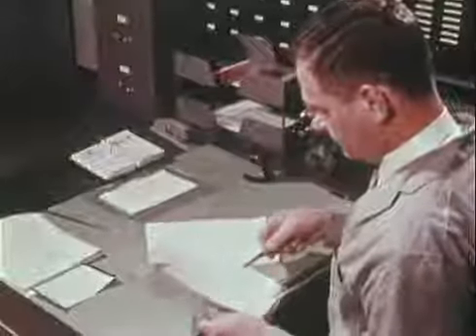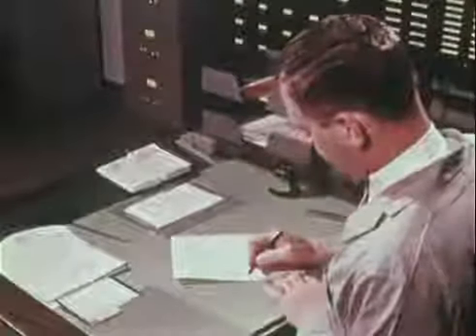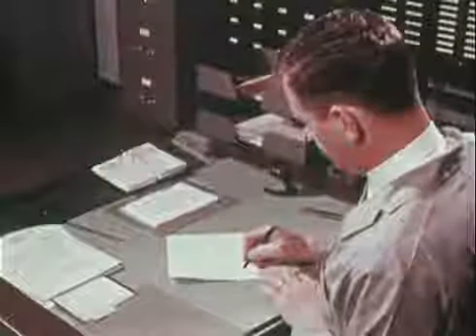The notepad yields yet more evidence. The examiner confirms that the torn edge of the bank robbery note matches the torn edge remaining on the carefully preserved notepad. This too will be photographed and included in the examiner's report.